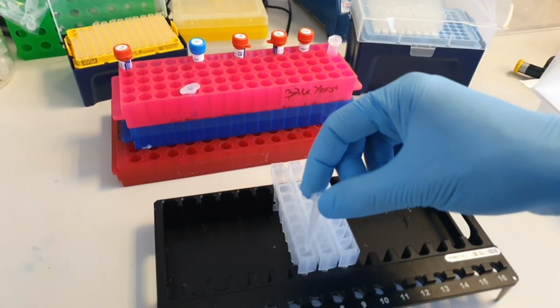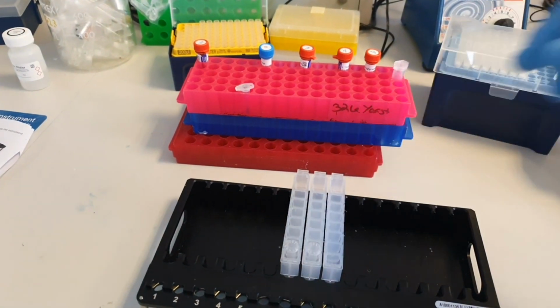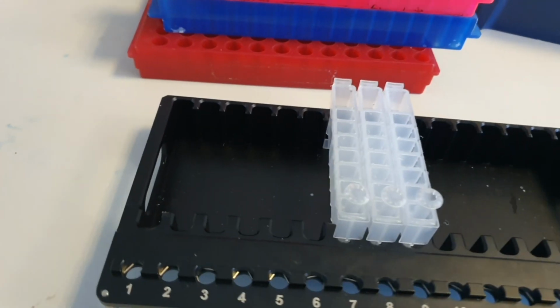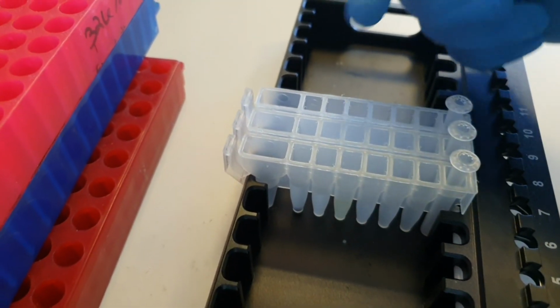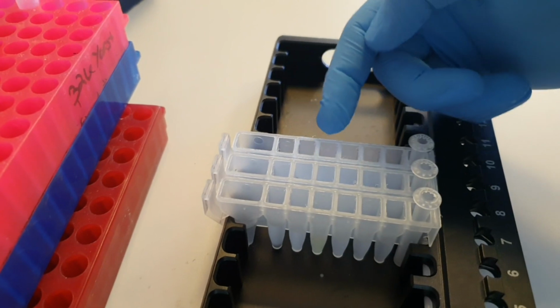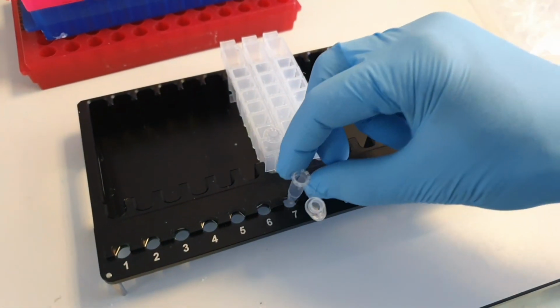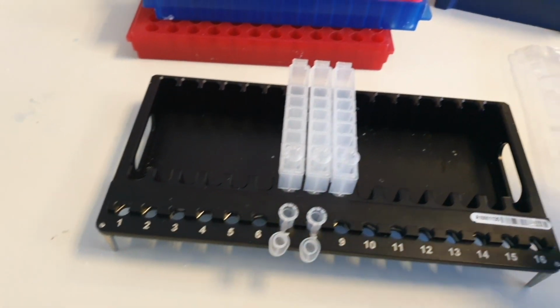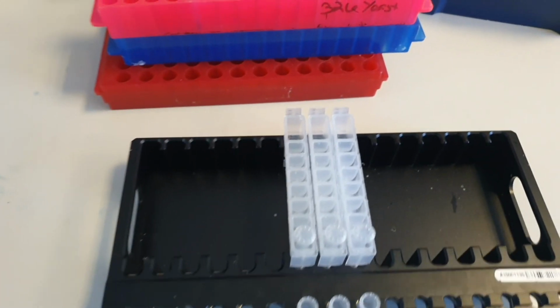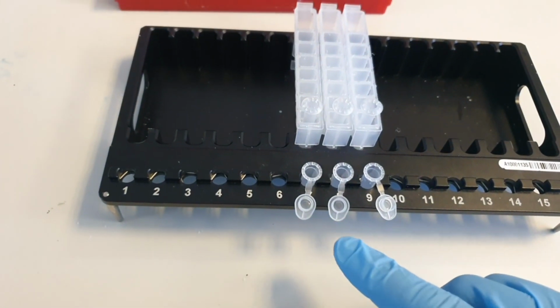The plunger will go in the first well from this side. Now we have the plungers in well number 8. The well numbering starts from this side: 1, 2, 3, 4, 5, 6, 7, 8. Next we have to place the 0.5 ml Elution tubes. They will go next to each cartridge. Now we have our cartridges and also our collection tubes in place.